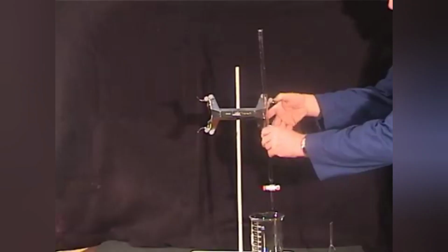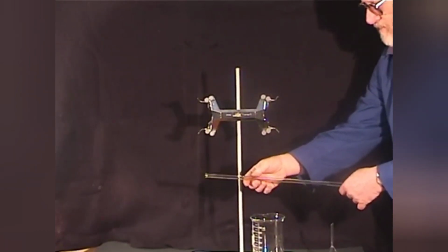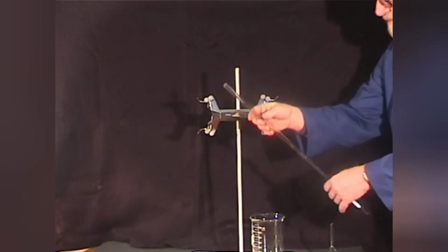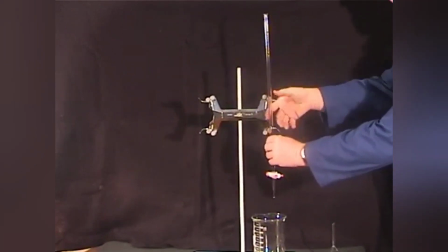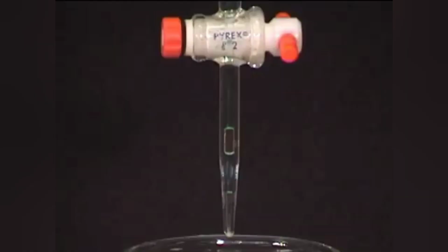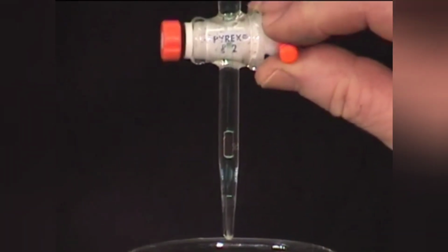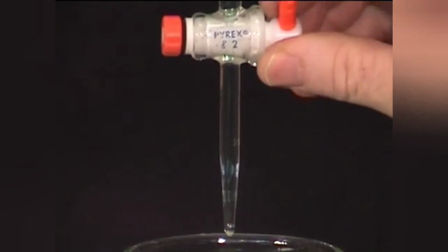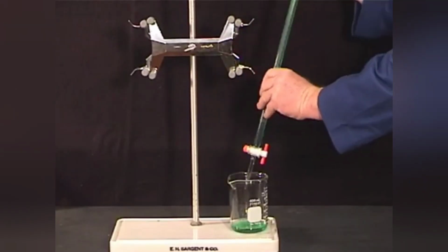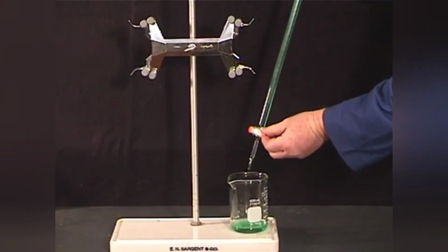To rinse the burette with the titrant, hold the tube in the near horizontal position and rotate it to rinse as much of the inner sides as possible. Then discard the rinse. Repeat this step twice more, then fill the burette with the same reagent. Fully open the stopcock to flush out any air bubble in the nozzle. If the bubble escapes during the titration, error is introduced. Stubborn bubbles lodged near the stopcock can be removed by giving the burette 1 or 2 vigorous shakes while it is draining.